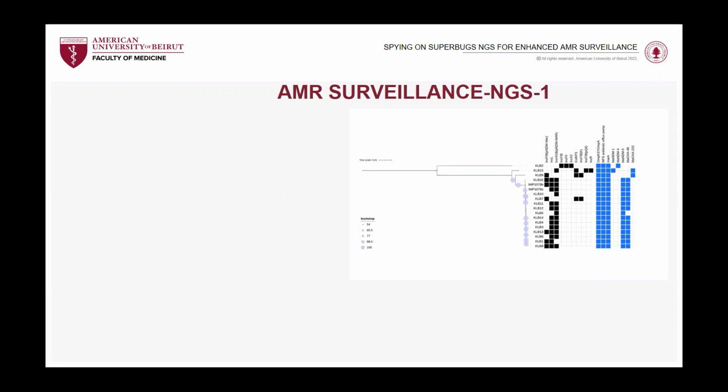We're finalizing, but you can see with the blue lines the plasmids that have been circulating, and it can affect several sequence types of Klebsiella pneumoniae, not just the 383 that we found. Yes. It's on plasmids usually, and they can pass it along.